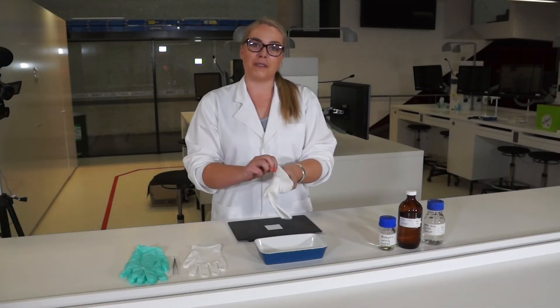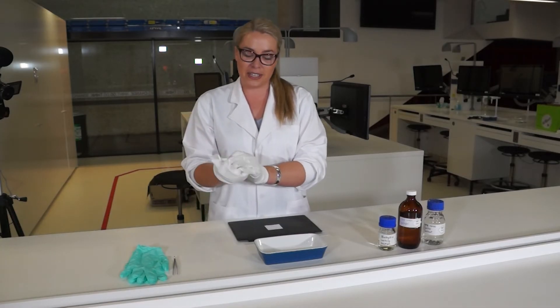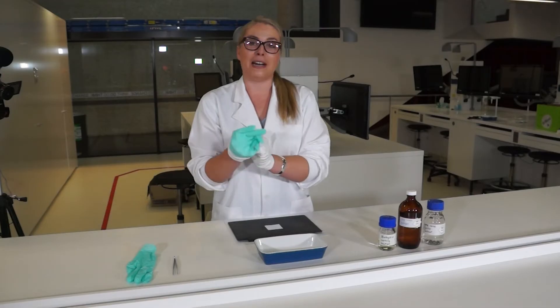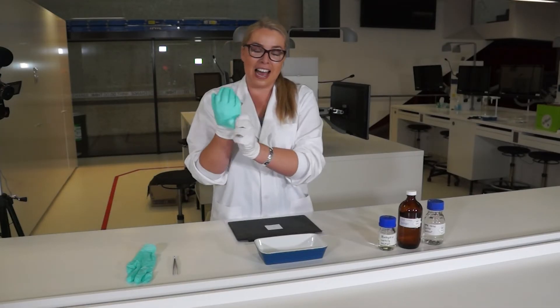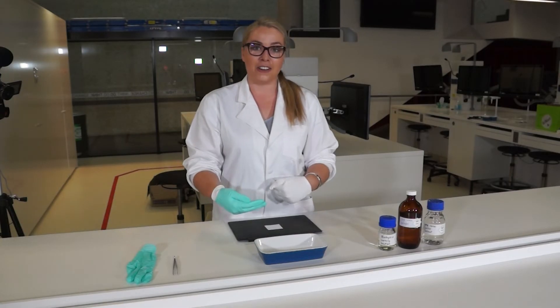Whenever we work in finger mark research we make sure that we wear cotton gloves underneath our other nitrile gloves. The reason that we do this is so that when I handle the paper I'm not actually transferring any finger marks from my hands onto the paper that I'm going to develop. That's obviously very important when you are working with evidence items, because you don't want the finger marks from the laboratory technician getting onto your evidence.